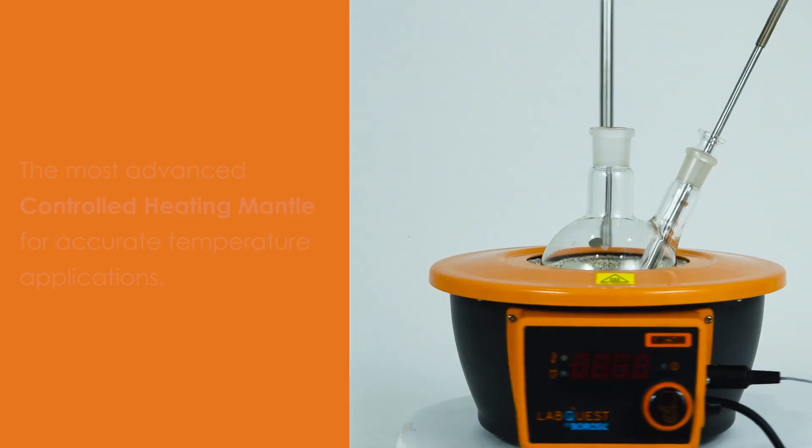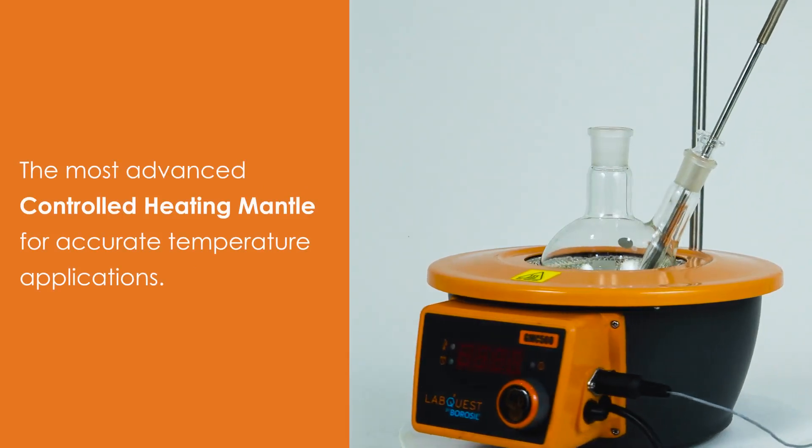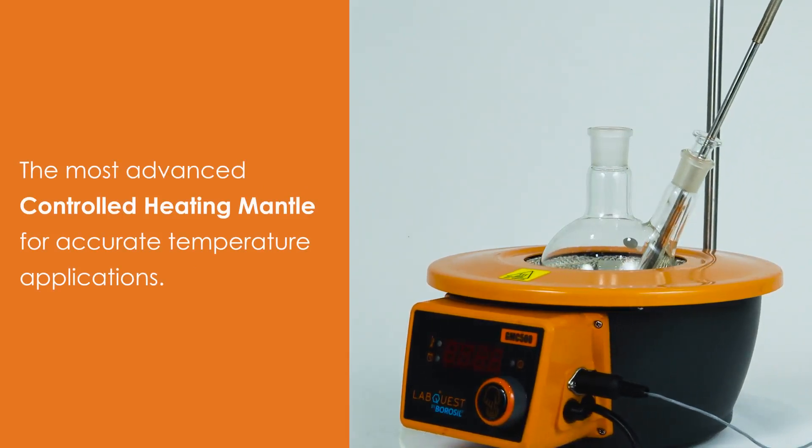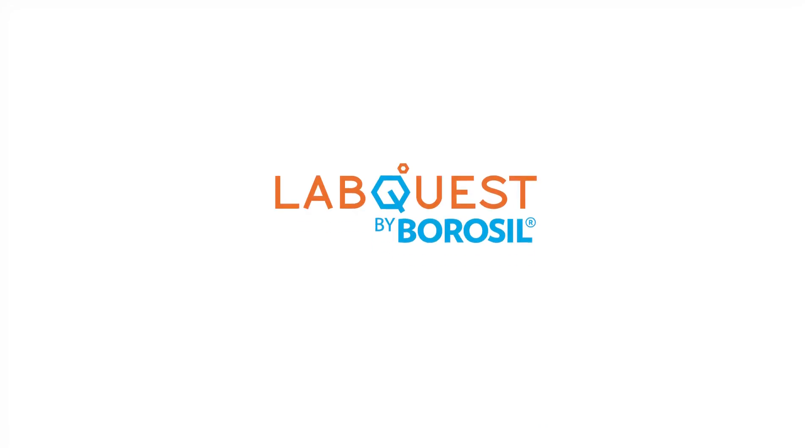Introducing GMC, the most advanced controlled heating mantle for accurate temperature applications. GMC for fractional distillation.